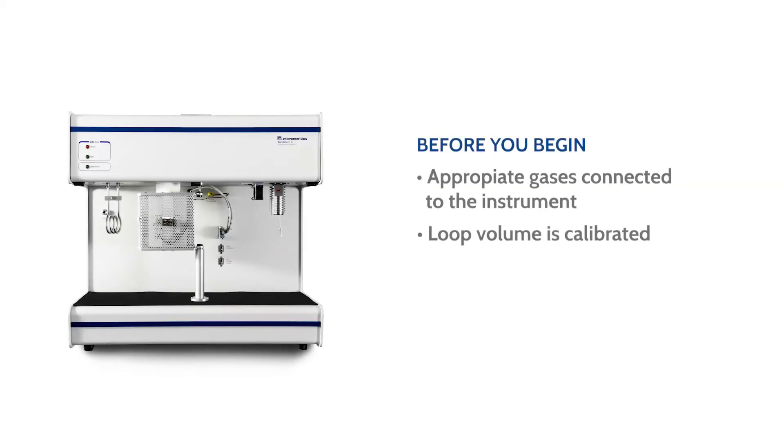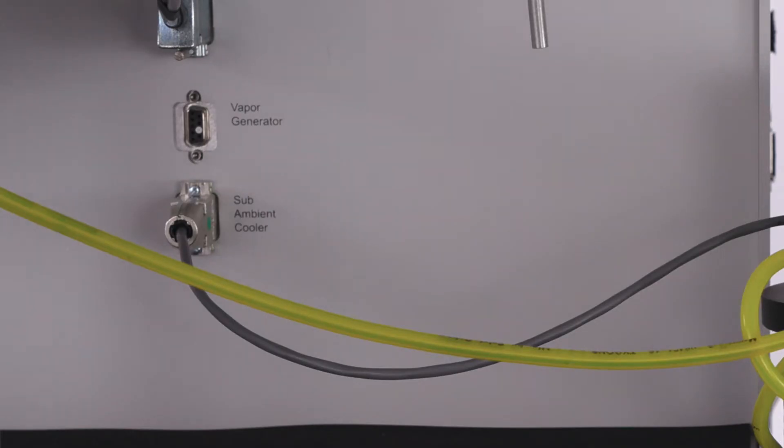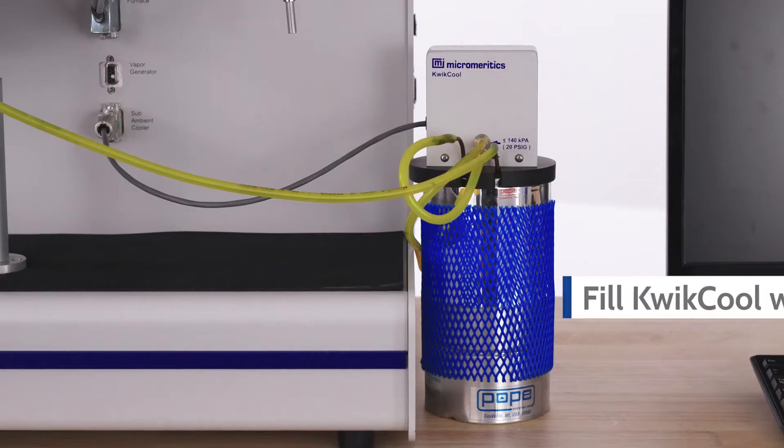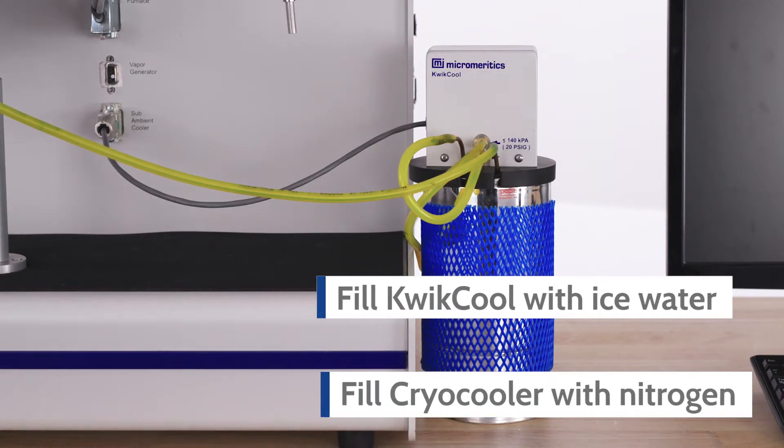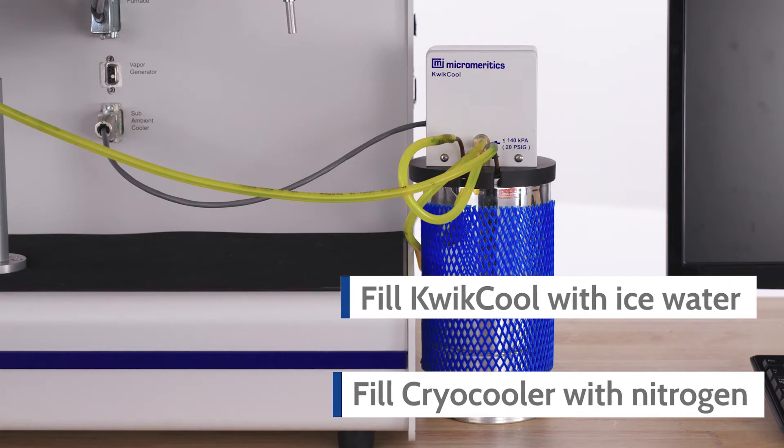And last, make sure a cooling system is connected to the instrument. This can be either the quick cool or cryo cooler. A cooling system can be connected to the instrument with a 9-pin D-cable. Verify the quick cool is sufficiently filled with ice water or the cryo cooler with liquid nitrogen before starting the analysis.